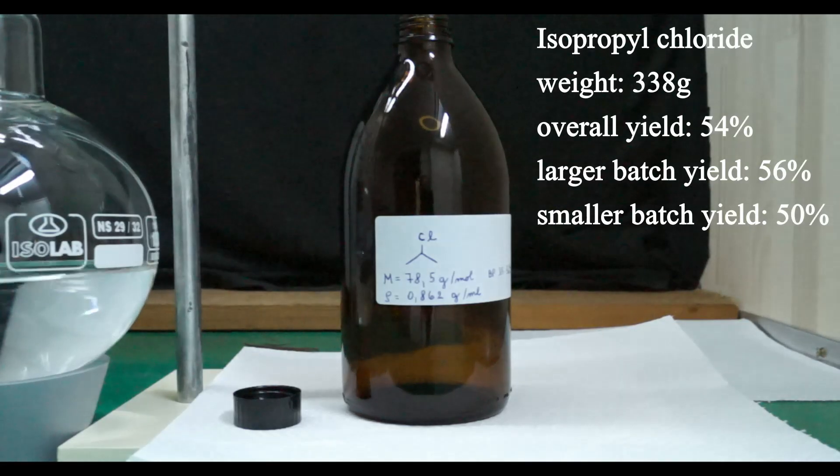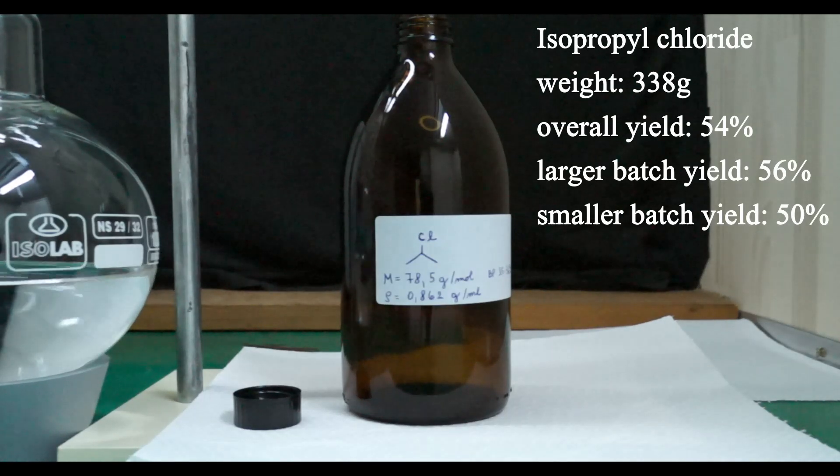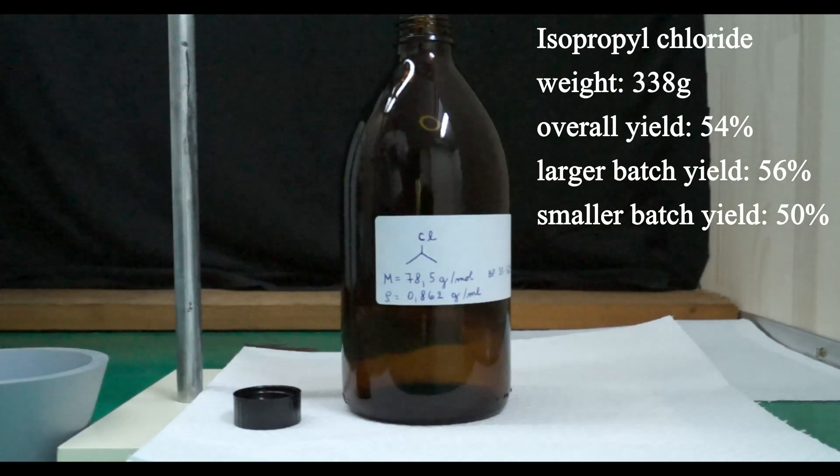The collected product is poured into a pre-weighed 500 milliliter amber glass storage bottle. The isopropyl chloride that I collected weighed 338 grams. This represents an overall yield of 54 percent based on the starting isopropyl alcohol.